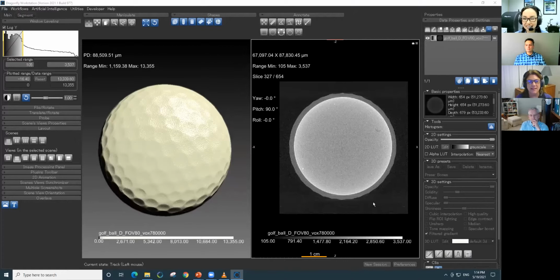Yeah, I was muted. So would you first do some smoothing of the image, detect edges, and then do the thickness analysis? Or would you do a watershed object separation, segmentation, and then analyze? Or instead, would you recommend segmenting, refining the ROI, and then doing the thickness analysis?